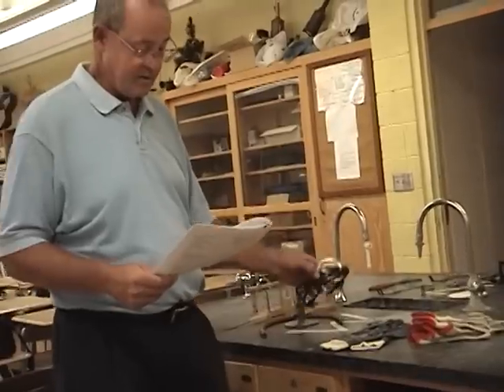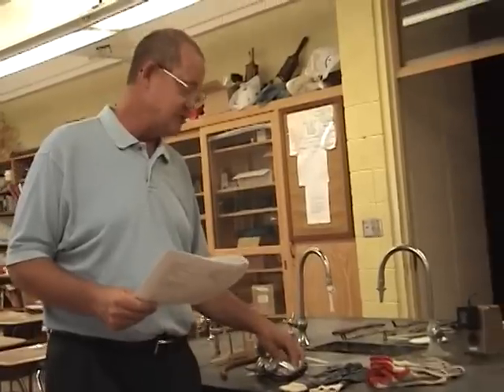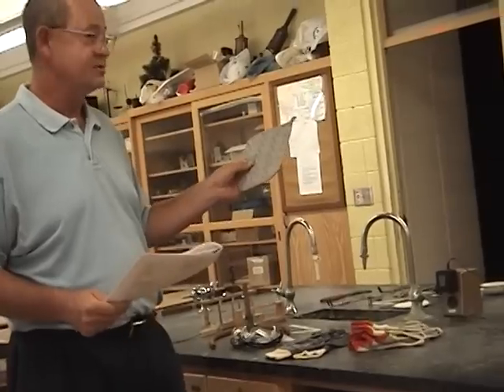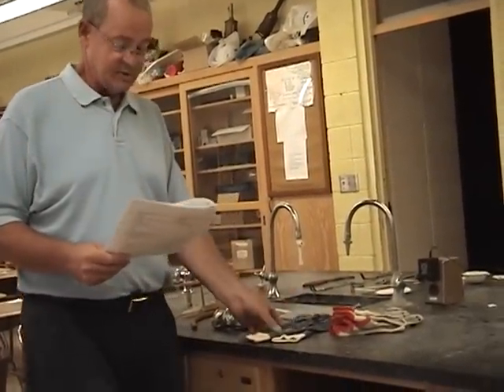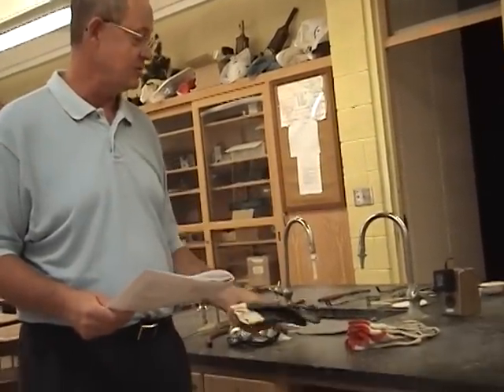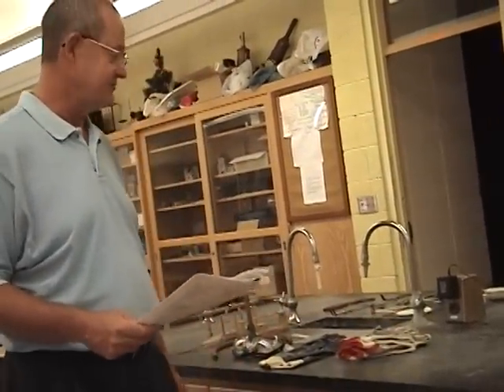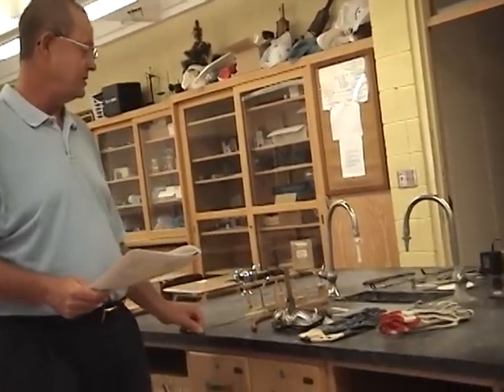We have three safety goggles, provided by Federal Detachment Services originally through Monsanto. We also have a hot pad — sometimes you'll want to use that to pick up items when you're not sure how hot they are, to protect your hands. For additional hand protection, we have one pair of heavy vinyl gloves, which are small gloves best suited for smaller-handed students. We also have three pairs of rubber-nubbed cotton gloves, also provided through Monsanto. That concludes the miscellaneous items in Drawer 3.